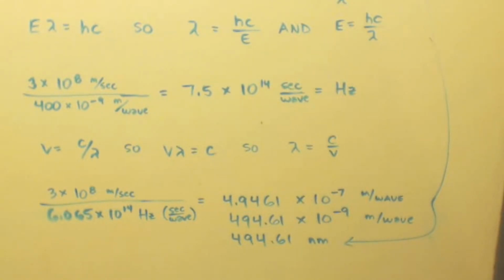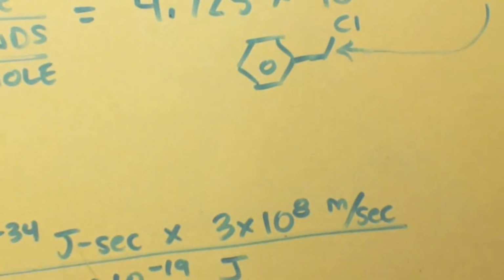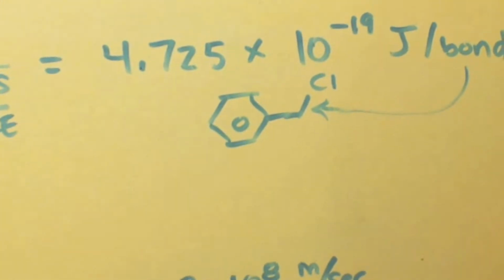And 400 nanometers is lower than this number. So 400 nanometers UV light is obviously going to work to break your chlorine-chlorine bonds. Now the thing about this is you're going to make some carbon-chlorine bonds. Even if it's an alkyl group with a C-Cl bond, or a group with an H instead of a C, those are all harder to break than this benzyl carbon-chlorine bond.